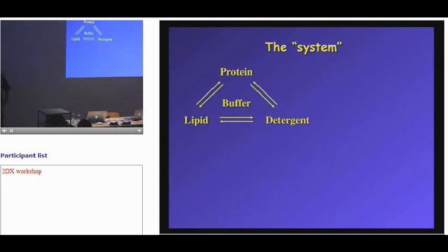So this is the next way. The first slide is the kind of way that I look at it. And then one way that I learned to look at this is from Andreas' lab: basically you have three components that interact with each other. You have the protein solubilized in detergent, you add detergent-solubilized lipid in some kind of buffer, and then you remove the detergent and you try to get 2D crystals.